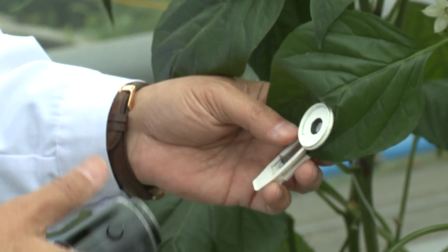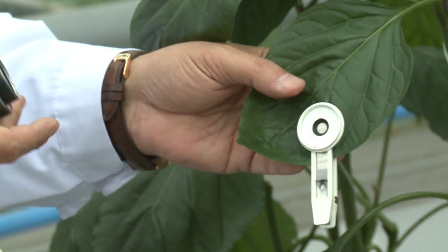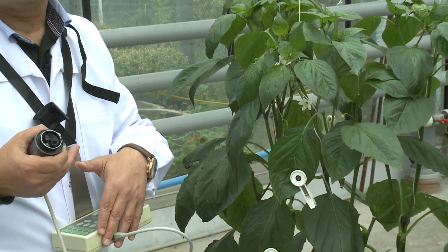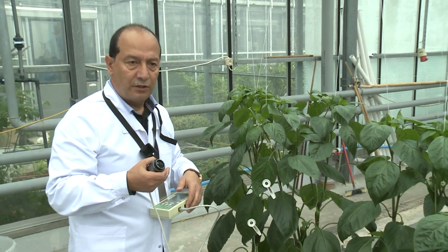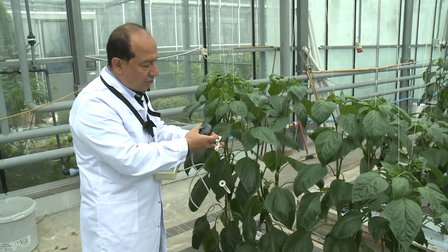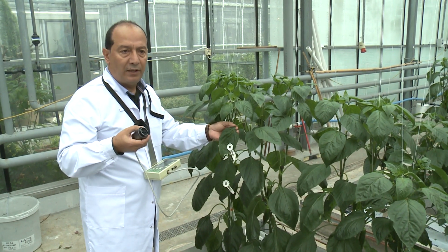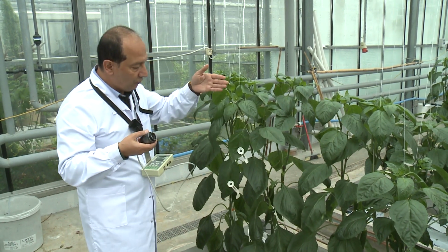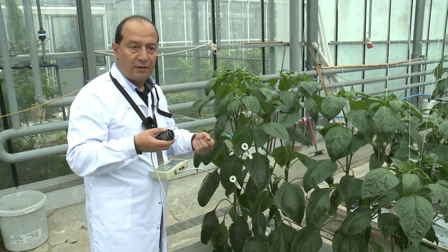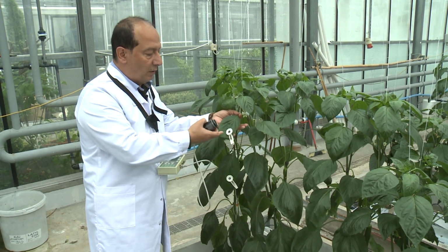So usually you put the head sensor on the leaf clips, which we are using for dark adaptation. And the dark adaptation of the samples here is required because we are measuring, by the use of this type of instrument, the maximal activity of photosystem 2, that means the potential of the photosynthetic machinery or apparatus. Then we have to use such clips, or the other way is that you can cut the leaf and take it into the dark in your lab, and then you can measure there using only one clip, so you don't have to have a big amount of leaf clips, but it will be, as I said, an invasive, destructive measurement, because you will take the leaf inside the lab in the dark, and then you can measure directly without the help of these clips.